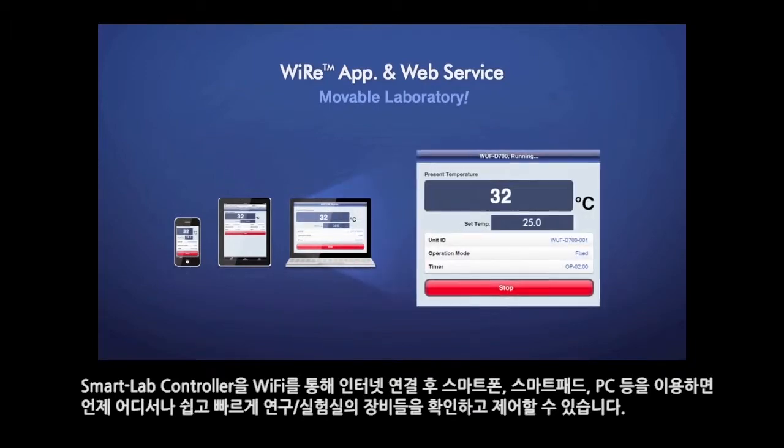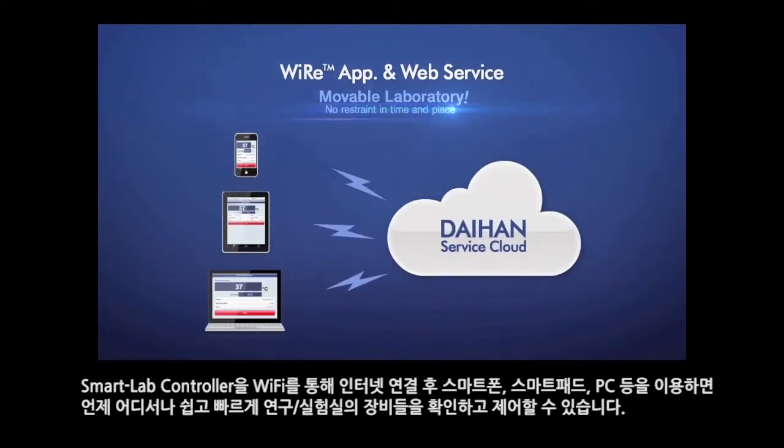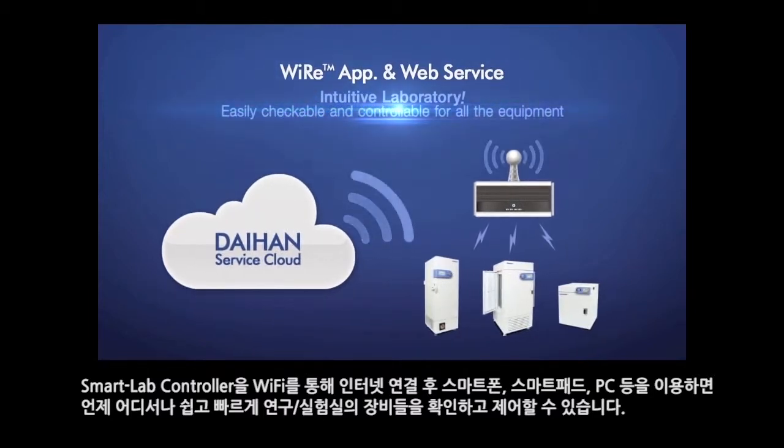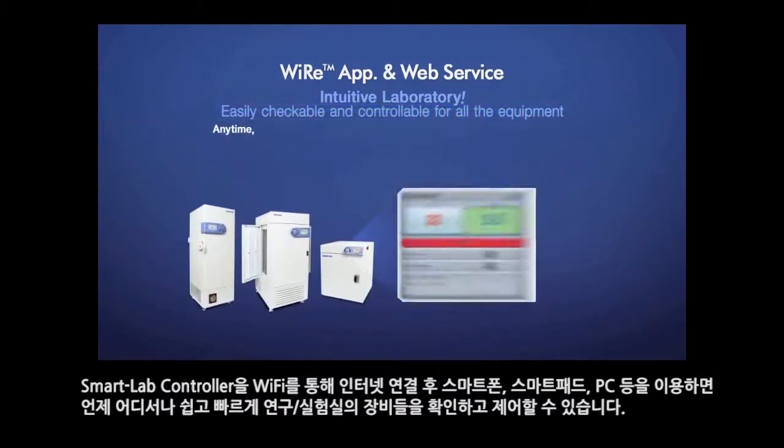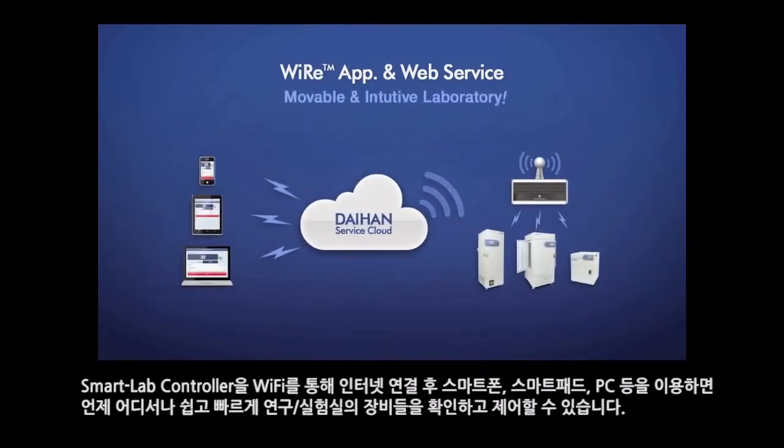Connect the smart lab controller to the internet via Wi-Fi, and then utilize smartphones, tablets, or a PC for checking and controlling the equipment in the lab easily from anywhere at any time.